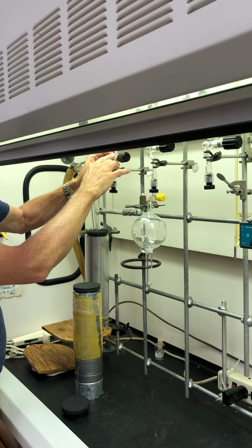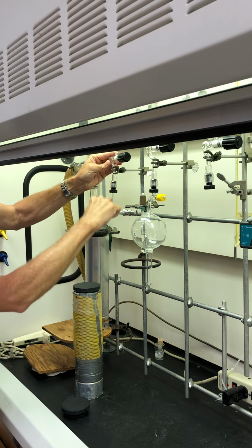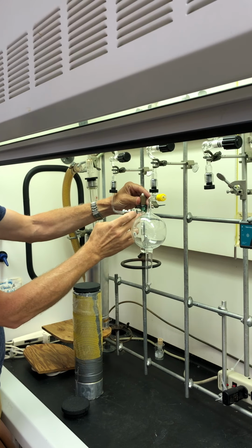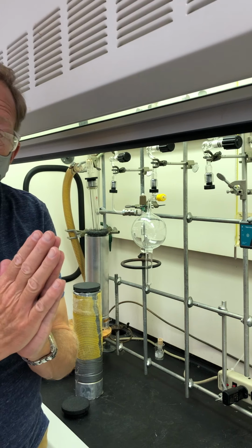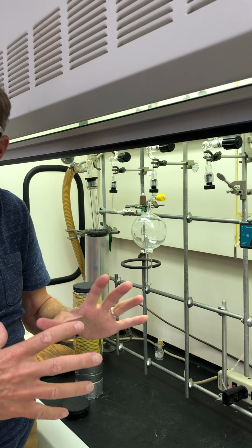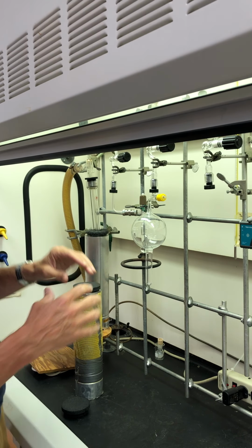For valve A, if I open this up, that removes any air or vapor that's in this portion of the vacuum line. And now this last valve is sealed off for the liquid. We want to freeze that to a solid using liquid nitrogen. And then once it's solid, we can open the valves and pump away anything that doesn't freeze to a solid. That'll be like air. That makes sure that we don't have air mixed with our vapor.